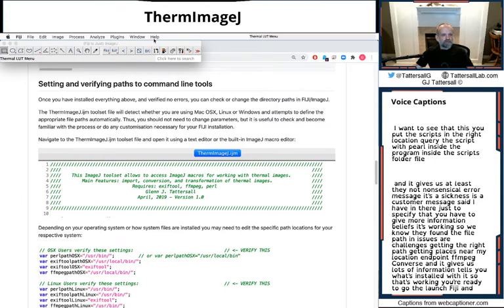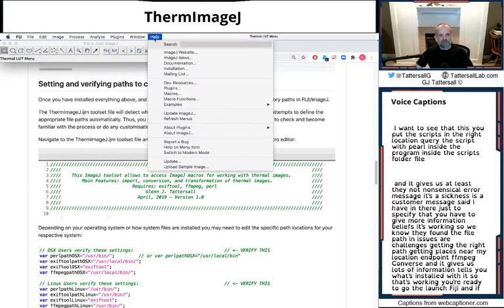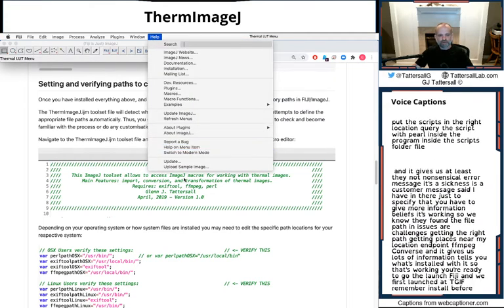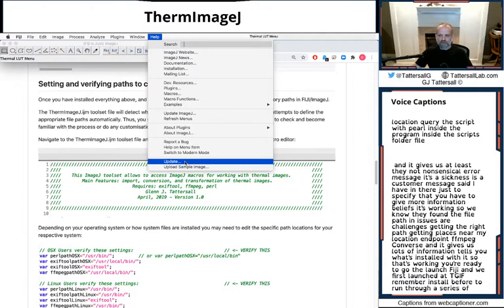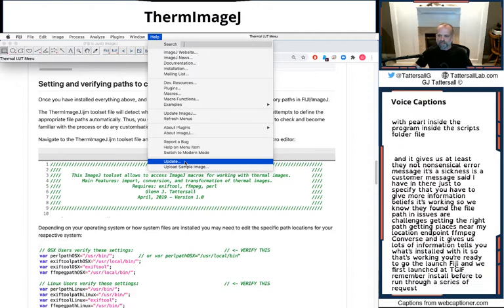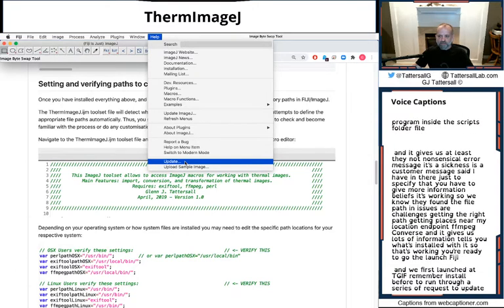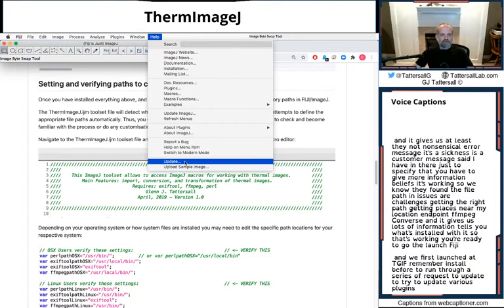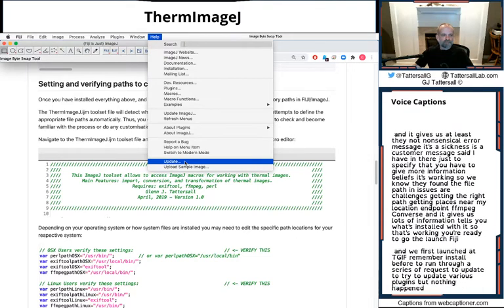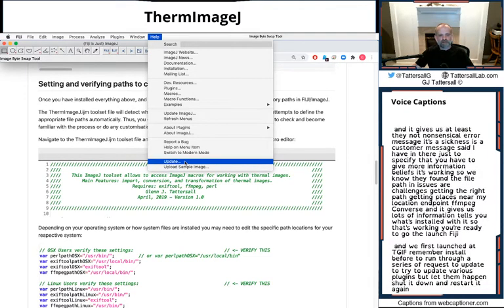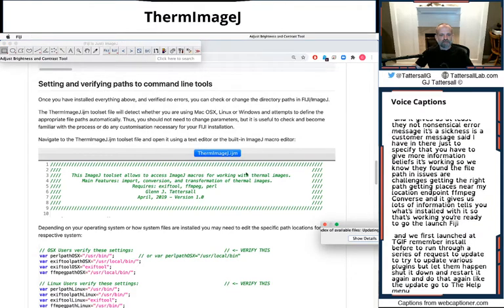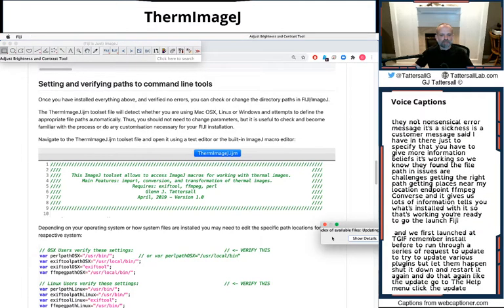And when you first launch Fiji, if you've never installed it before, it'll run through a series of requests to update or to try to update various plugins. But let them happen. Shut it down. Restart it again. And do that again. Click the update. Go to the help menu. Click the update command.